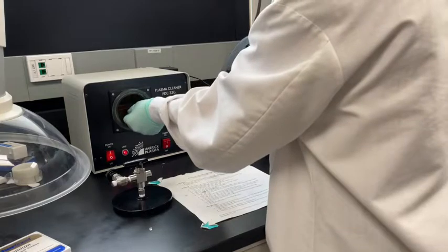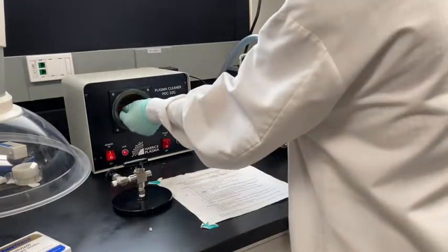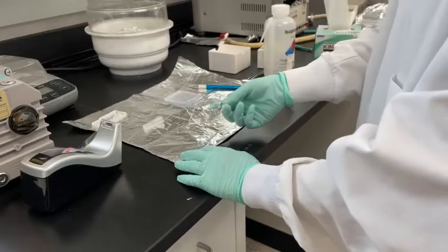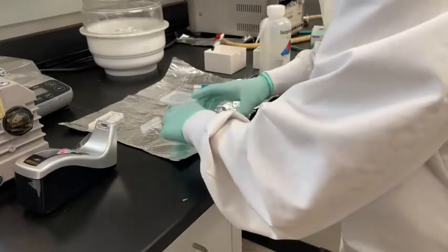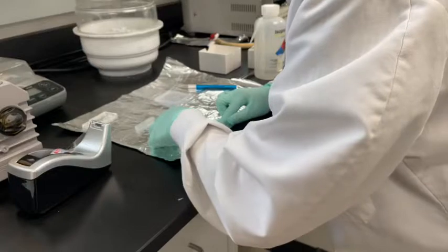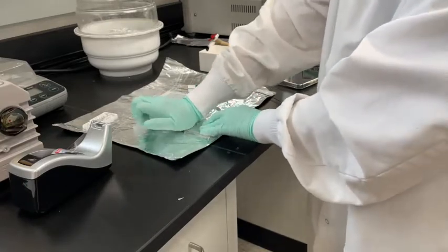Next, while limiting the amount of time, remove the orange tray and the microscope slide. Place the PDMS chip on the aluminum foil with the treated exposed side still face up. Then, while using gloved hands, pick up the microscope slide. Avoid touching the treated side and place the treated side on top of the exposed surface of the PDMS chip, making good contact. If the process is done correctly, a bond is formed as soon as the two surfaces touch. Press the surfaces together to make a bond along the entirety of the chip. You should wait 30 minutes before introducing liquid and using the chip. Place scotch tape on the exposed PDMS surface when not in use to maintain the quality of the chip and prevent dirt and dust from getting into the reservoirs and channel. You have now fabricated a PDMS chip.